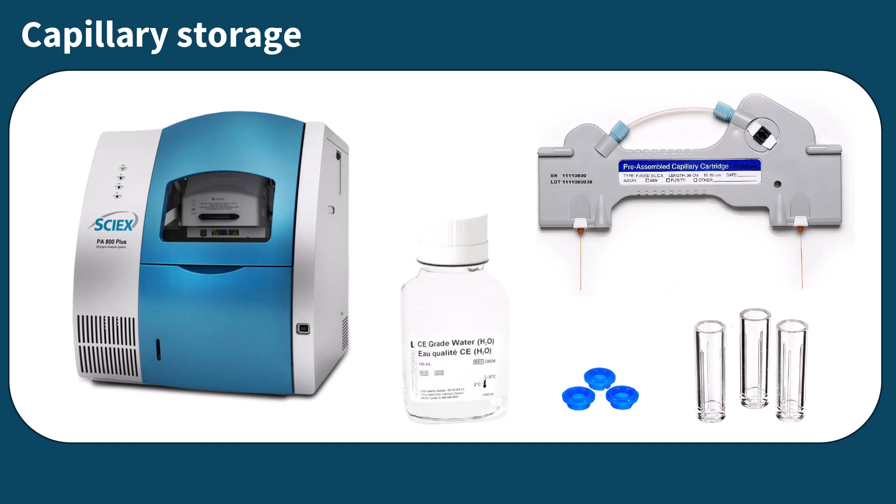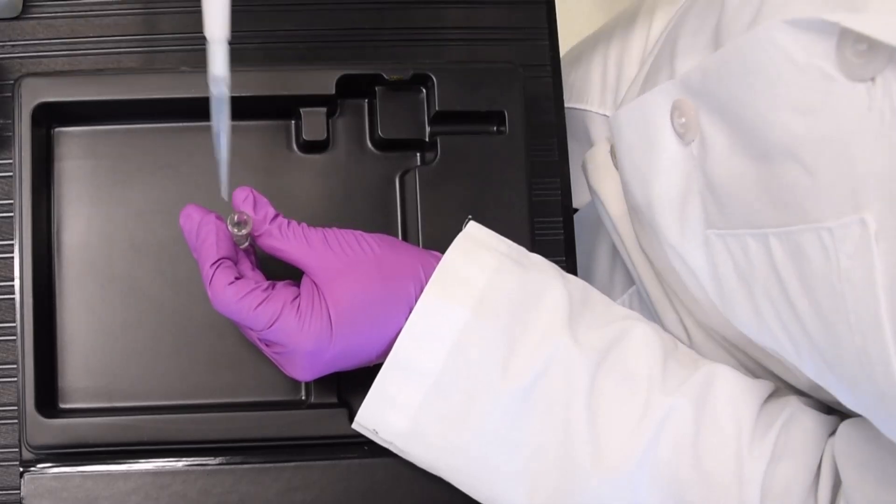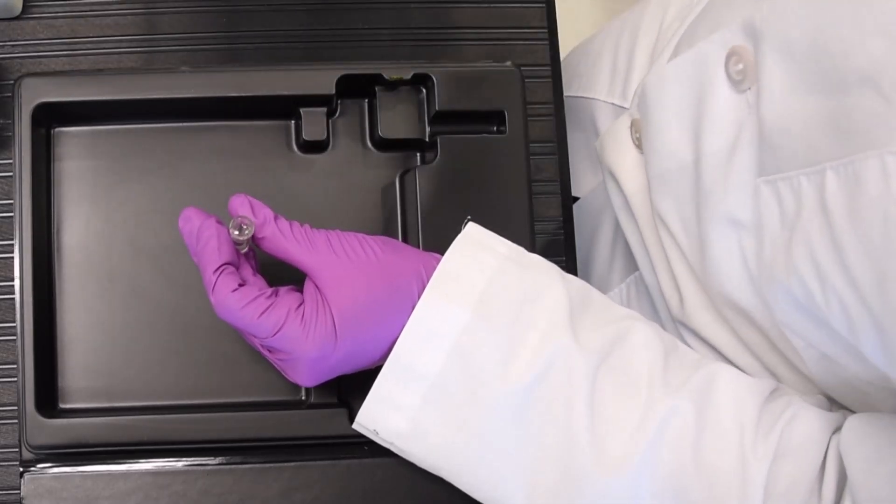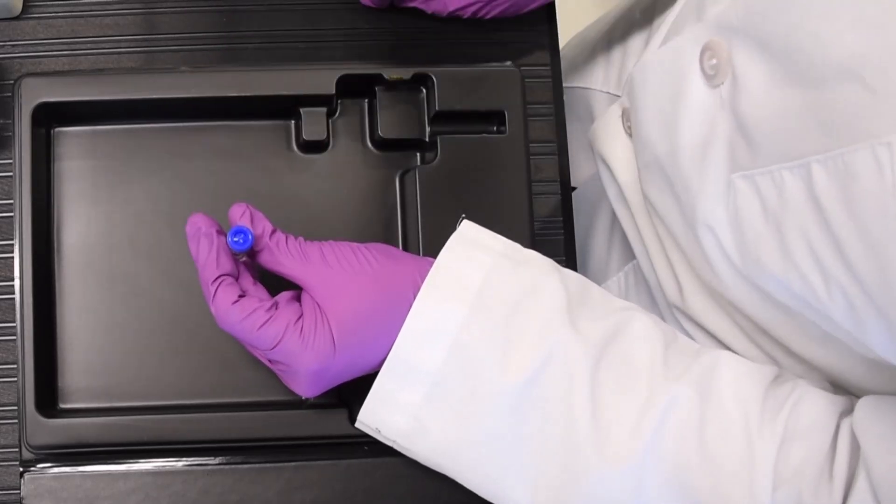In this video, we'll show you how to store your capillary for longer than 24 hours. To begin, fill two universal vials with 1.5 milliliters of CE-grade water and make sure to cap the vials securely.